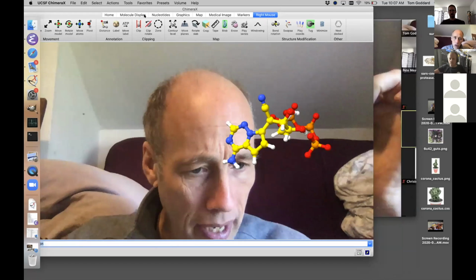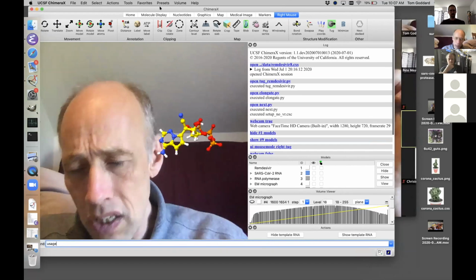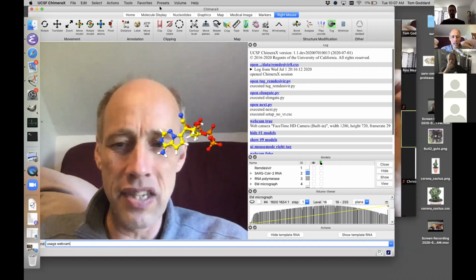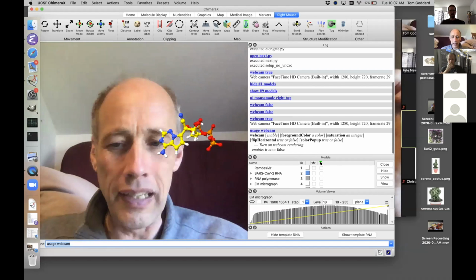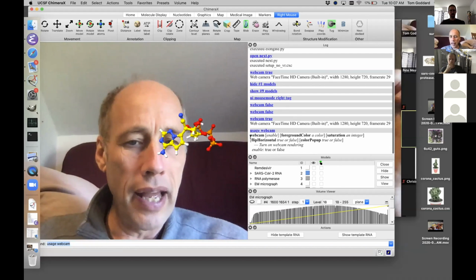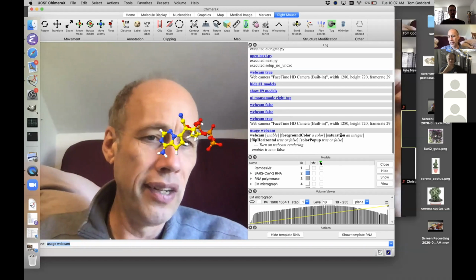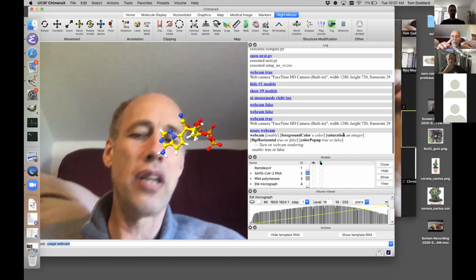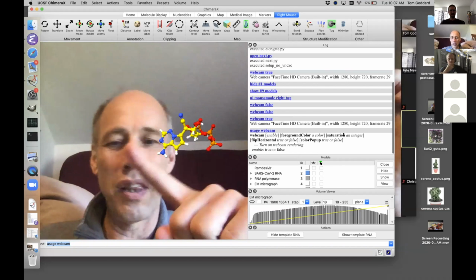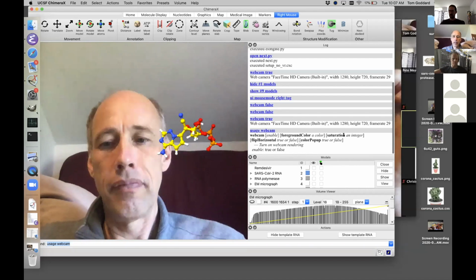Sorry, I just want to be able to show the log there. If I type the command usage webcam, because this is so new, it's not in the documentation yet. I'm going to add it today, or send the documentation information to Elaine in my lab, but it's not currently in the manual. So I typed the command usage webcam, and now it says webcam enable, foreground color is an option, saturation. Saturation has to do with how green the green pen has to be in order to be put in front. So you have to use the webcam command to turn it on and off now.